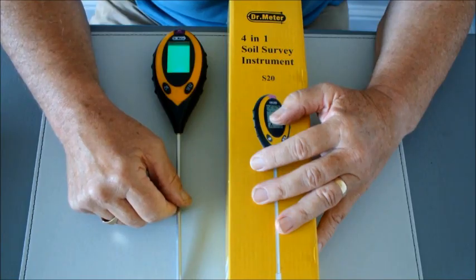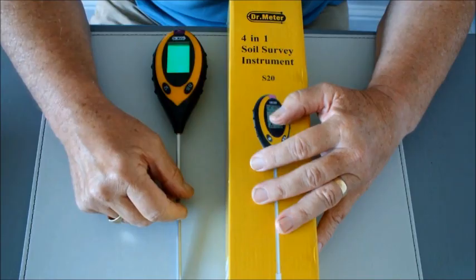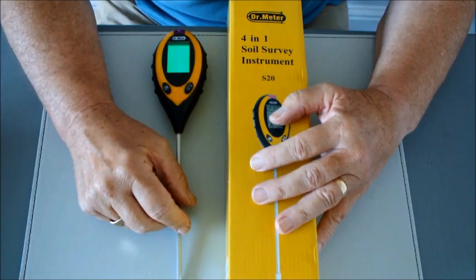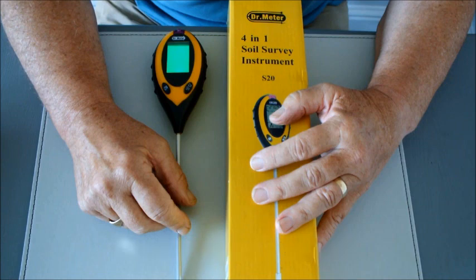What I'd like you to do is, as I check each of the items, perhaps record what the item is and the pH value that this meter gives us. Then at the end of the video, when I put that chart back up, you'll be able to see the level of accuracy and determine just how accurate this particular instrument is. Today we're testing this soil survey instrument — you may want to do a similar test yourself, put it up on YouTube, and we'll get a chance to see how your instrument performs.